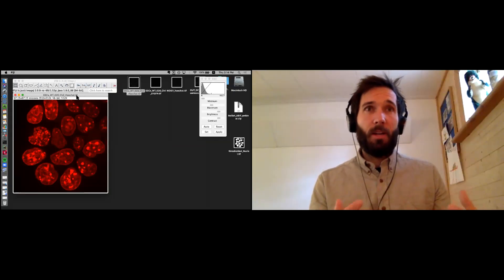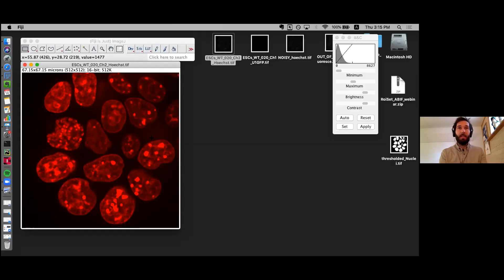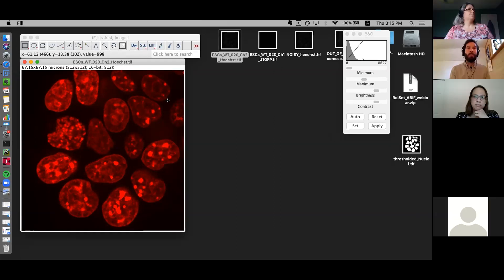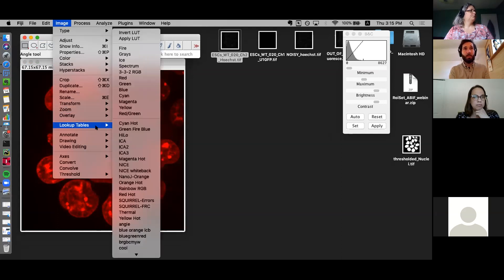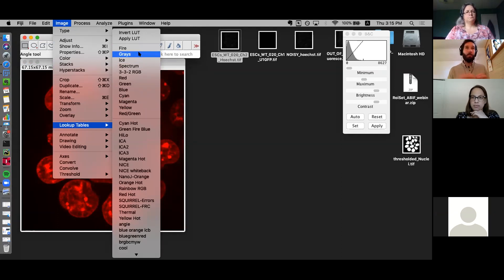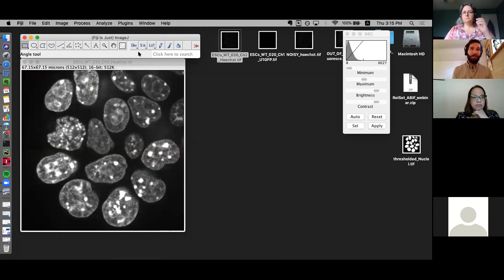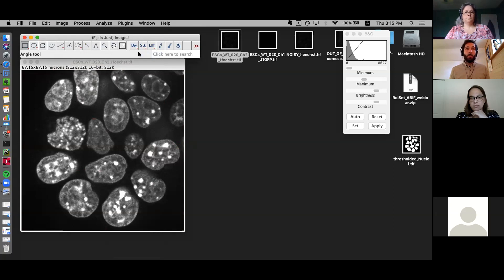It's generally suggested that when working on a single channel image — in this case just the DNA stain — work in grayscale rather than colorful LUTs like red, because it's easier to see subtle differences in intensities. To do that, select your window, click on image, go to the lookup tables submenu, and choose 'Grays'. The lookup tables are the color coding for different pixel intensity values. Note that changing the LUT does not change the intensity values — this is just for visual display.